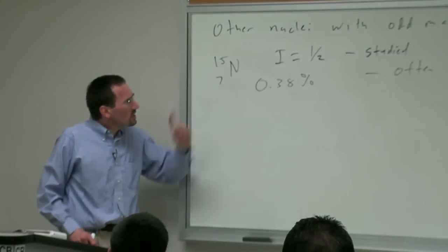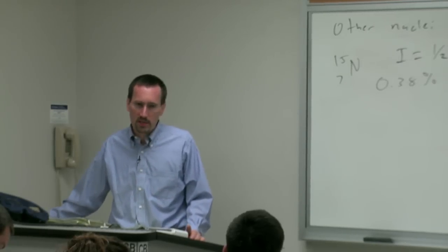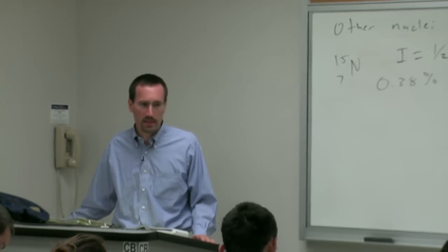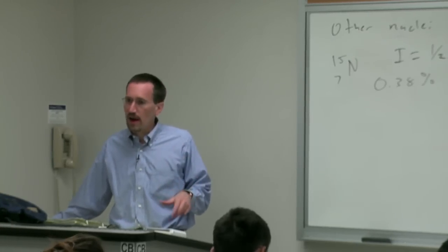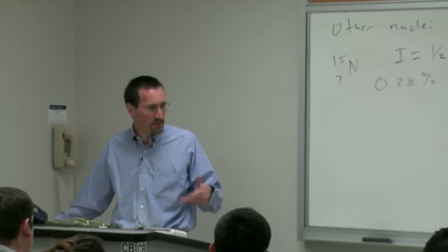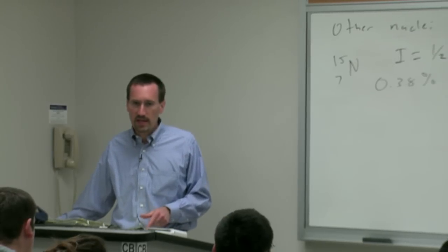N15 is starting to become more important in some natural product structure determination. Alkaloids, as you may have seen, for example, in Neil Garg's talk, have lots of nitrogens in them. And so being able to figure out the positions of those nitrogens can be very important. In the case of something like an alkaloid or a synthetic project, you might not be able to put N15 in.